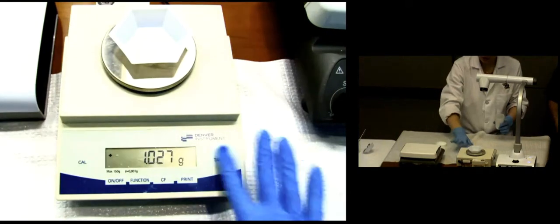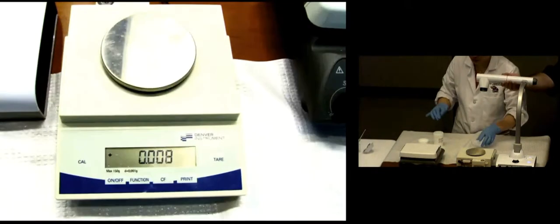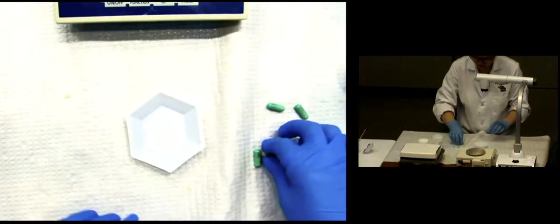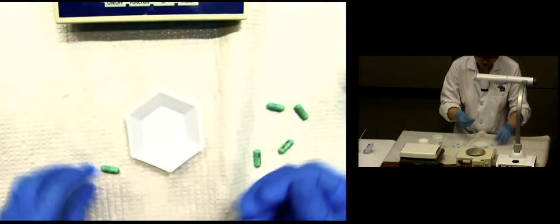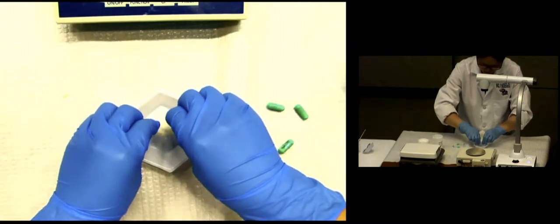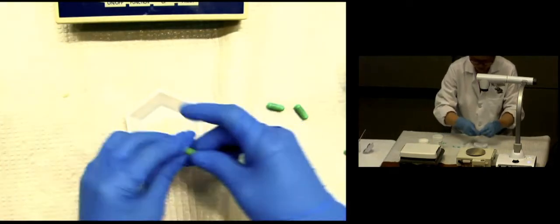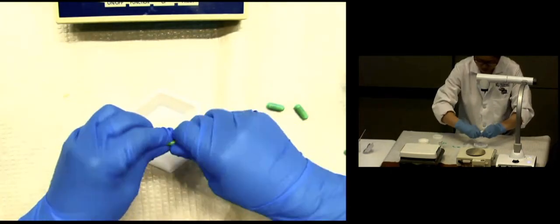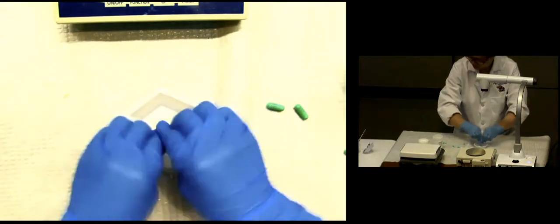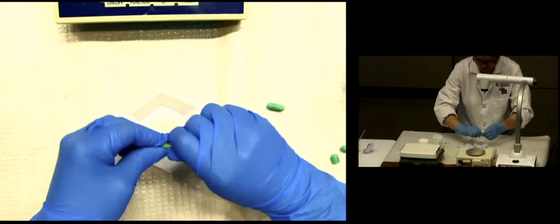Indomethacin is a giant capsule. Here first, open 5 of them. Some of you guys might be opening them better than me now. Judy said that you guys were tired of me messing with you, so she's just opening these capsules.